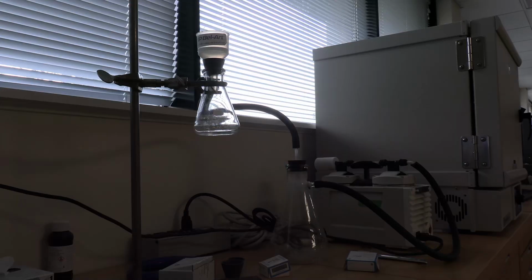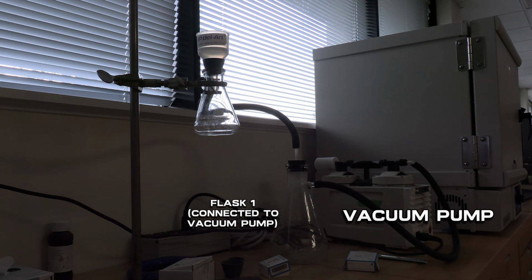Vacuum filtration is a process that allows liquids and solids to be separated more effectively than gravity filtration, using a vacuum pump and 2 filtration flasks, which have a side attachment where a vacuum tube can attach. One is connected directly to the vacuum pump, and the other, which is our receiving flask, connects to the flask that is connected to the vacuum pump.